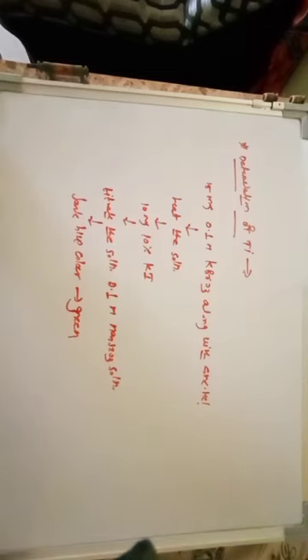After that you have to calculate the amount of both Fe and titanium, and then find out the percentage. So this is all about this ilmenite ore.